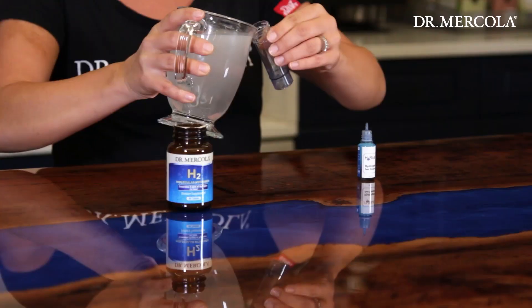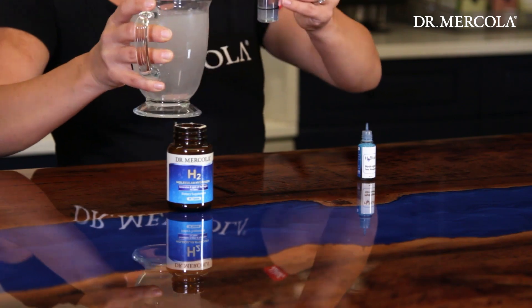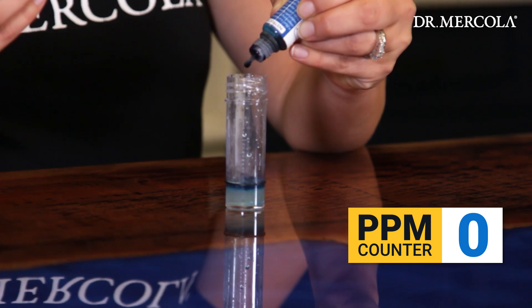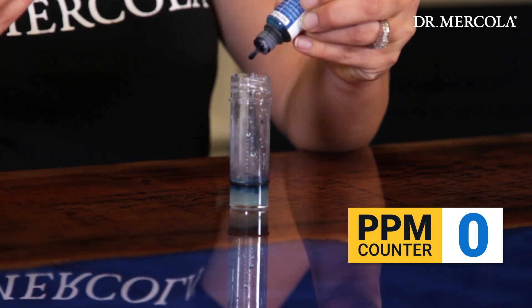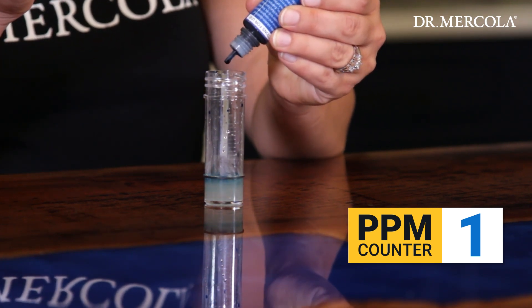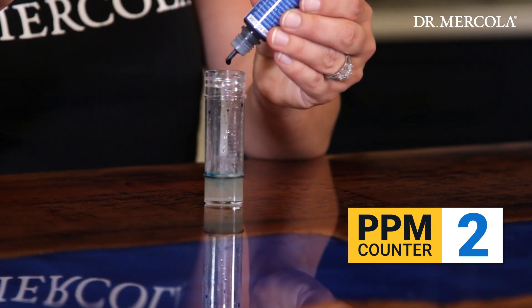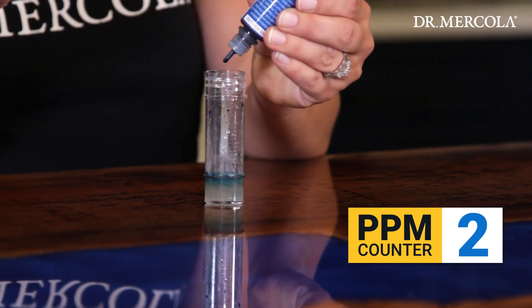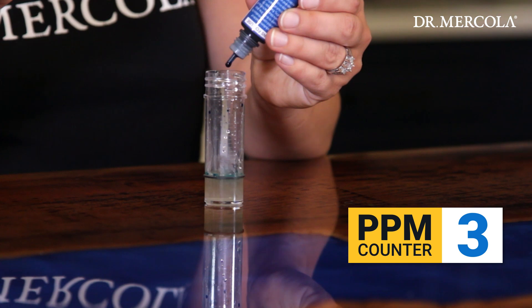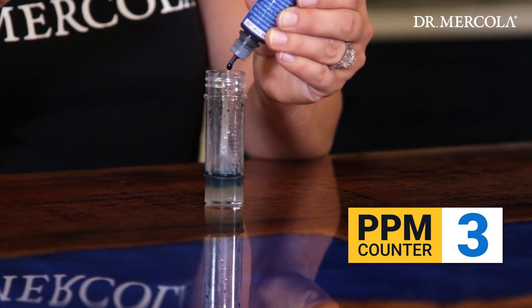Our tester starts by pouring 6 milliliters of the hydrogen water into a test tube to simplify the testing process. She will then add the H2 Blue drops to the sample, 10 drops at a time. Every 10 drops equals 1 part per million of dissolved hydrogen gas. We expect to get at least 8 ppm of hydrogen gas in this test, but it's possible to measure more. The tester stirs the sample after each addition of drops to see if the solution turns clear, which reveals the presence of hydrogen.